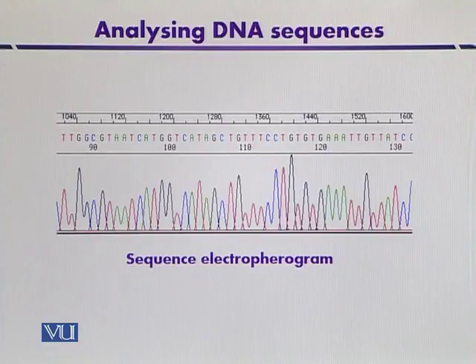For example, for thymine the color is red. For guanine the color is black here. It corresponds to a black peak, and green is for adenine. So different fluorophores are there for their respective dideoxynucleoside triphosphates. Whenever the chain reaction is terminated, it will be detected on the single lane within the gel.